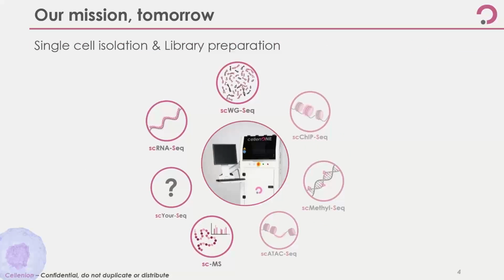What we want to achieve tomorrow is to provide ways to do single cell isolation as well as library preparation for all the omics purposes, and to develop new pipelines for genomics, transcriptomics, epigenetics, and proteomics.